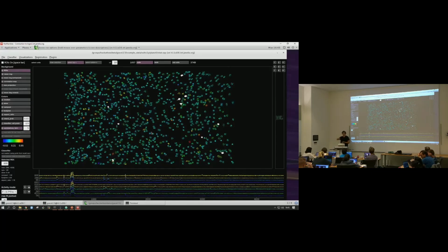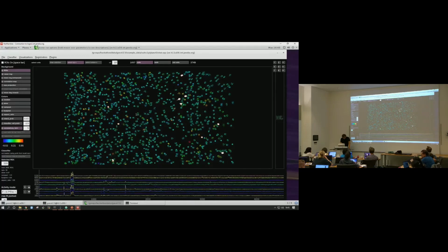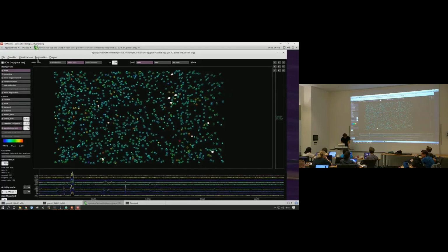So if we actually repeat this process now and say, select the top 10 of this in this view, it will keep iterating this way. Essentially you're doing a form of manual clustering at that stage, right? You're extracting groups of neurons that are correlated to each other. I guess I would have to press 10 again. Anyway, that's one of the things you can do in the GUI.